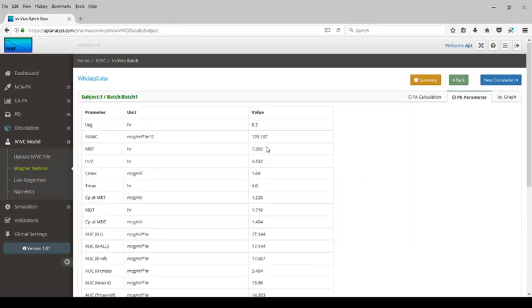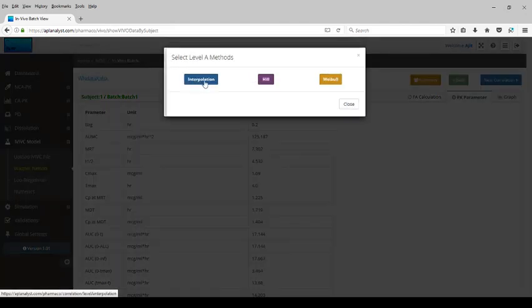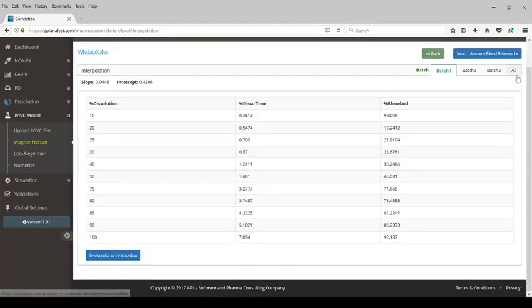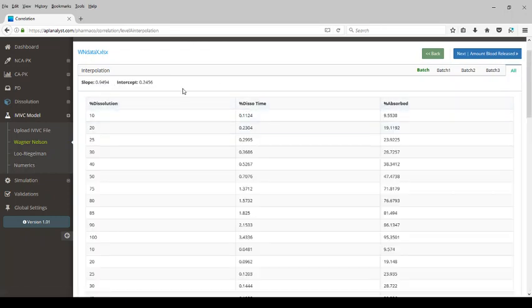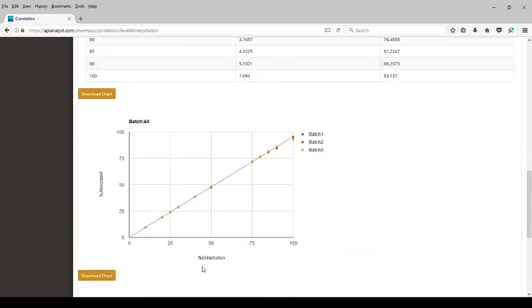PK parameters are also computed for this subject and batch. Next, let's perform the correlation. Let's look at Level A correlation. We have three methods: interpolation, the Hill method, and the Weibull function used for fitting the data. Let's select the interpolation method. The computation for all three batches with slope and intercept has been done, and here is the plot for percent absorbed versus dissolution for the three batches.